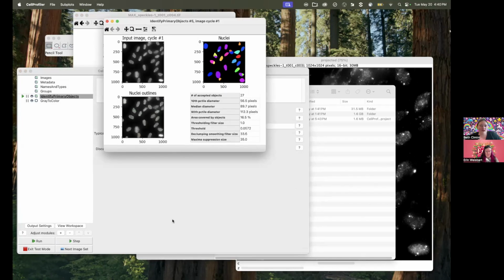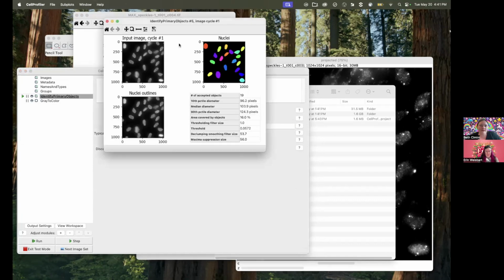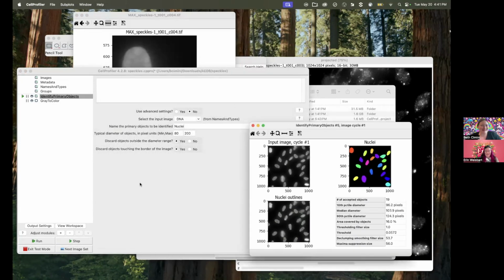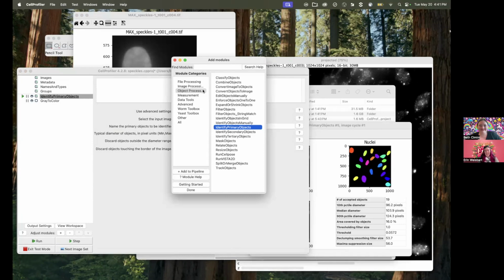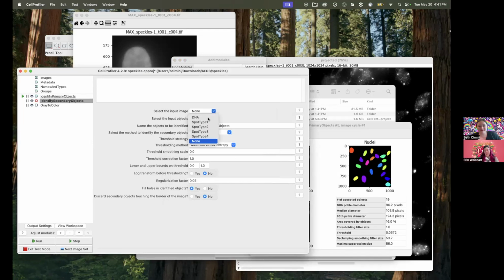Gorgeous. I'm going to change this bottom number a little bit because it's over-segmenting them. Beautiful. Look at that. Wow. Nuclei are so nice, so lovely. And look at CellProfiler: by taking in a couple of little settings, it's able to output default parameters that find your nuclei.